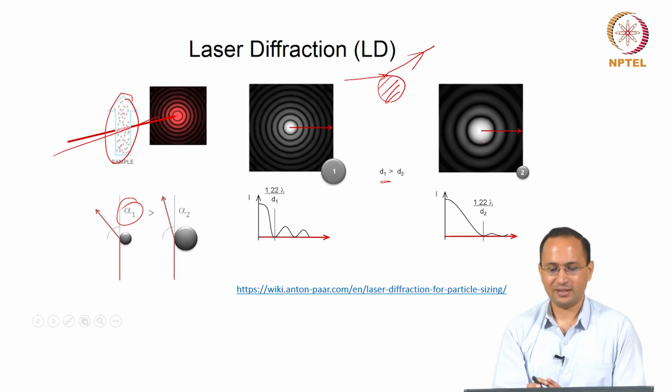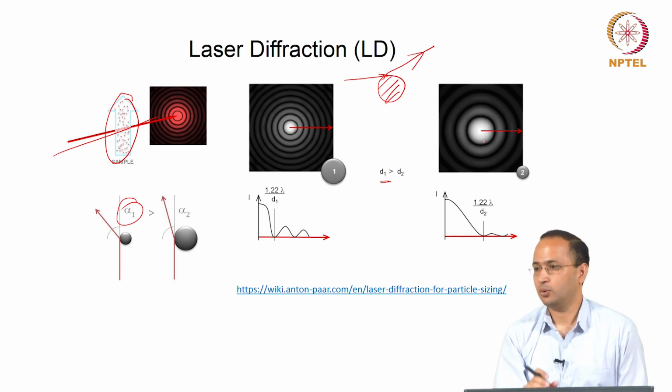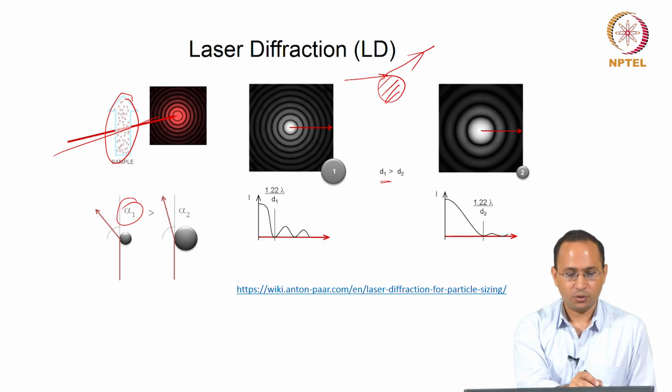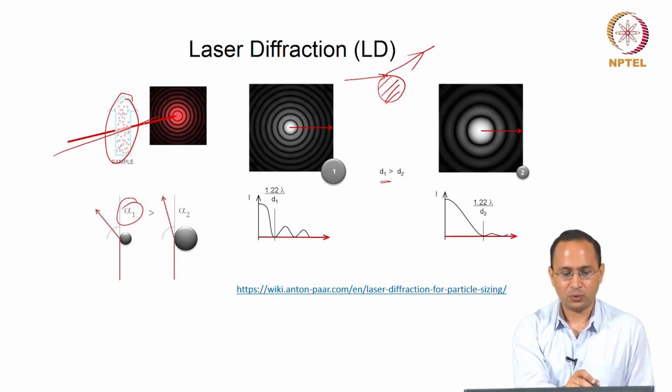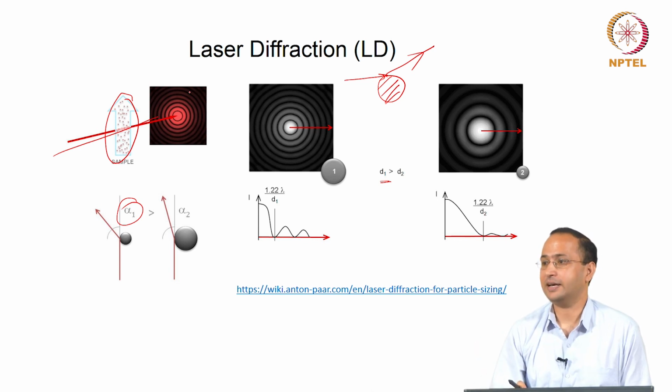So, there is a difference in the angle and also a difference in the intensity. That can be used to determine the sizes. So, those are the projected graphs? Yeah, it is the diffraction rings. So, where did they capture this? You have a sample and a laser passes through the sample and you see these rings. Detector. Yeah.